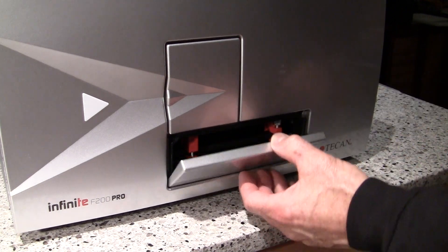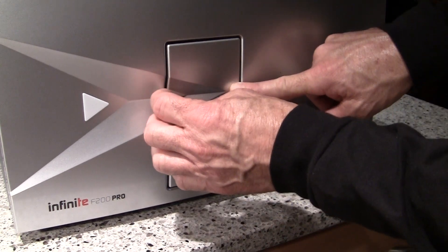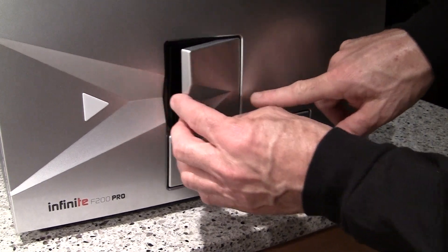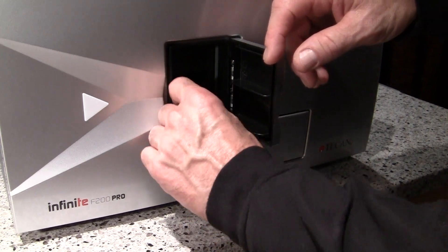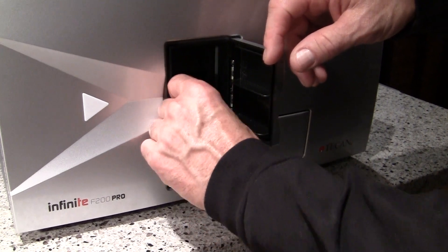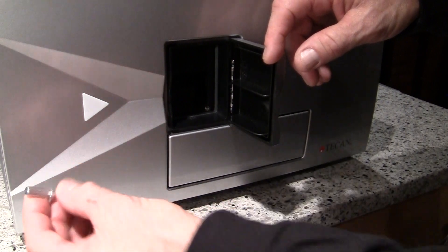To remove the first lock on the left, you'll want to open this door, usually by pressing in on it here and by pulling out, and you're going to back this screw off completely and remove the screw. Turn it counter-clockwise, and then set this screw aside.